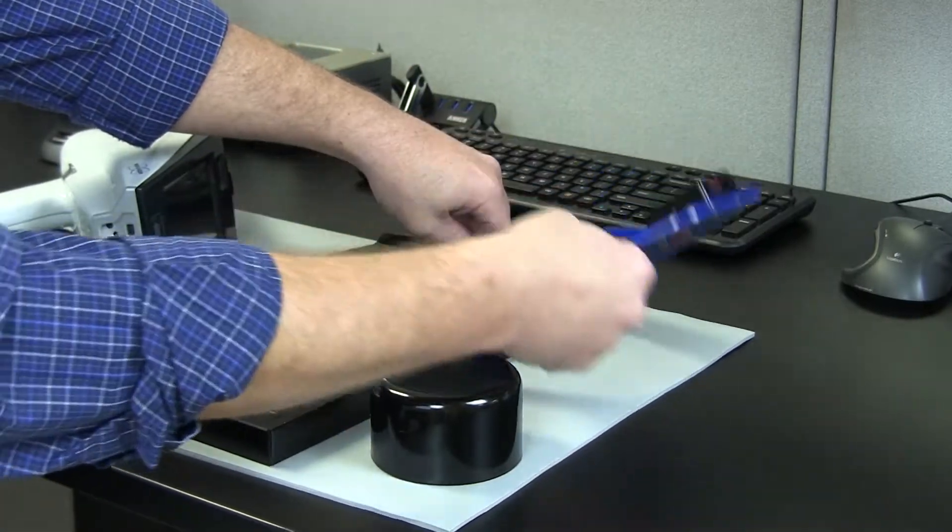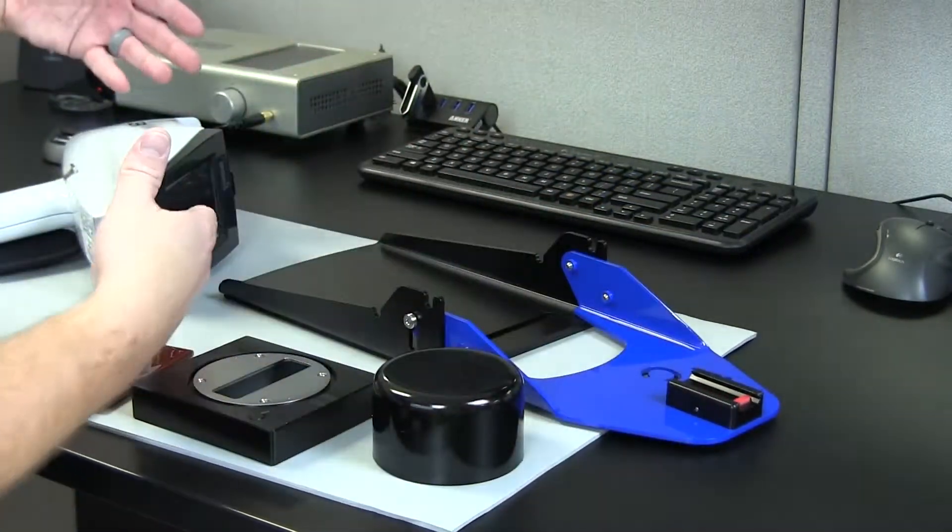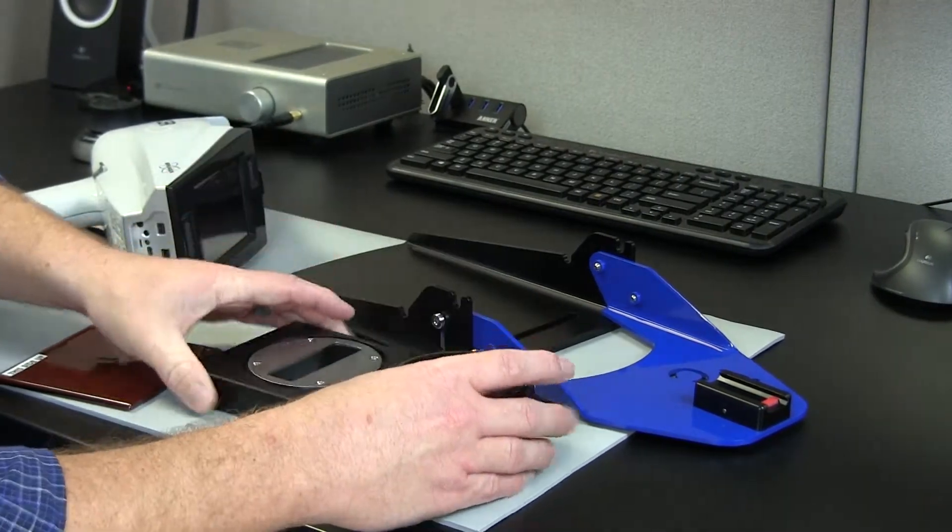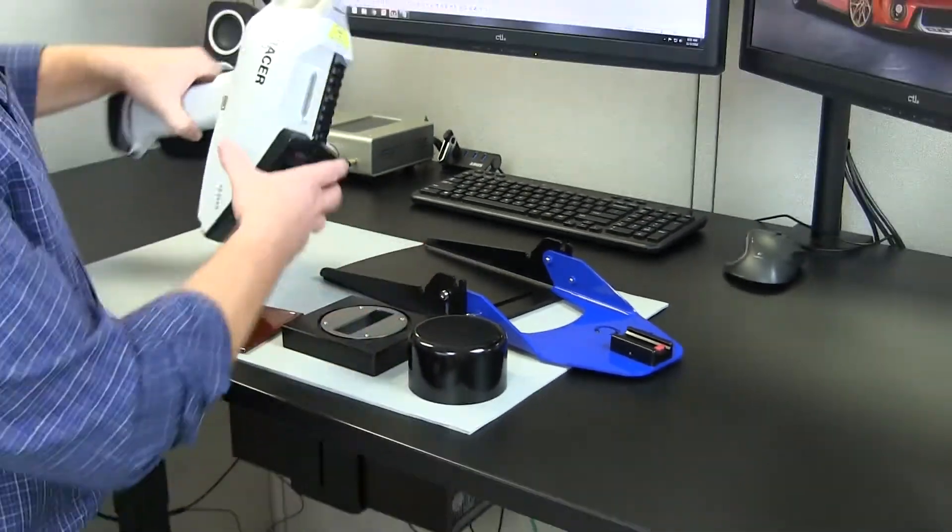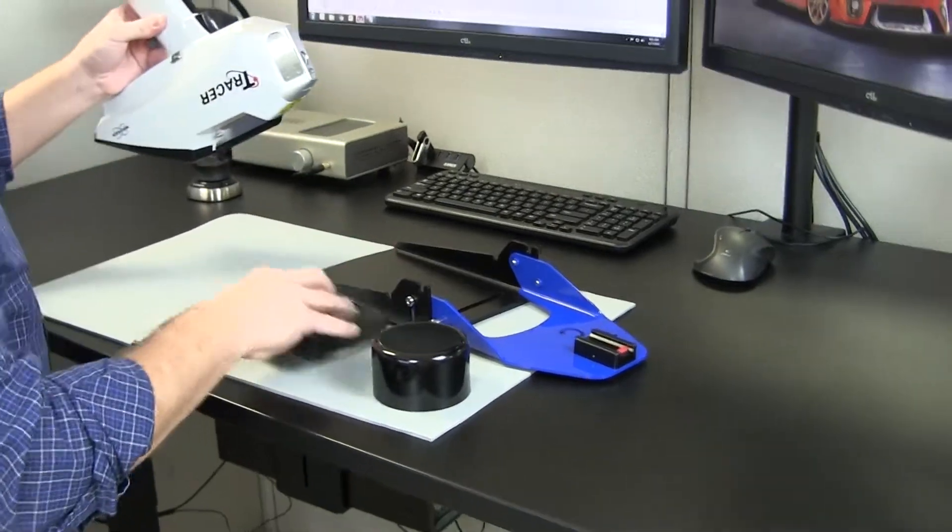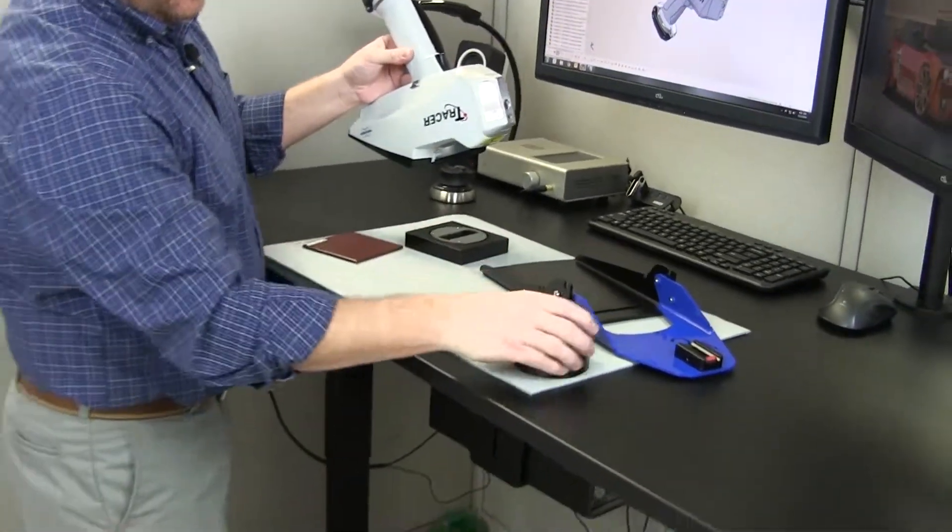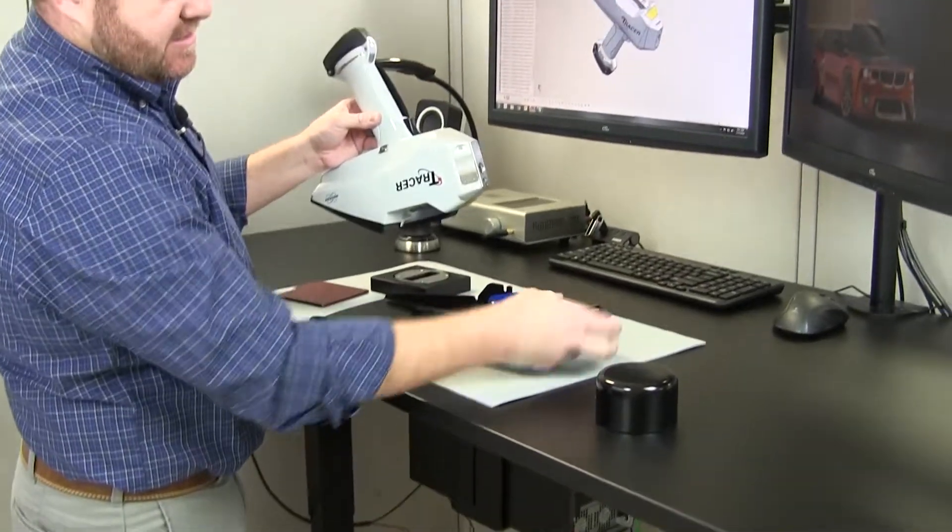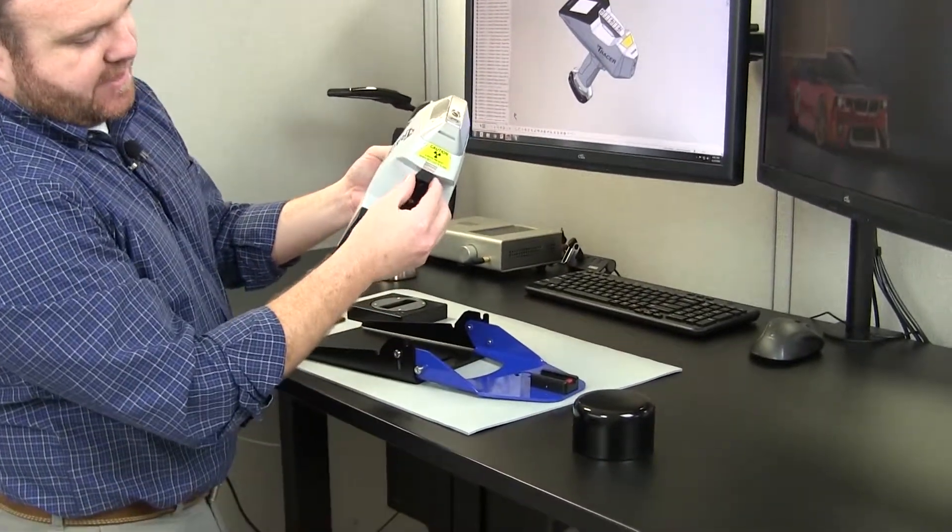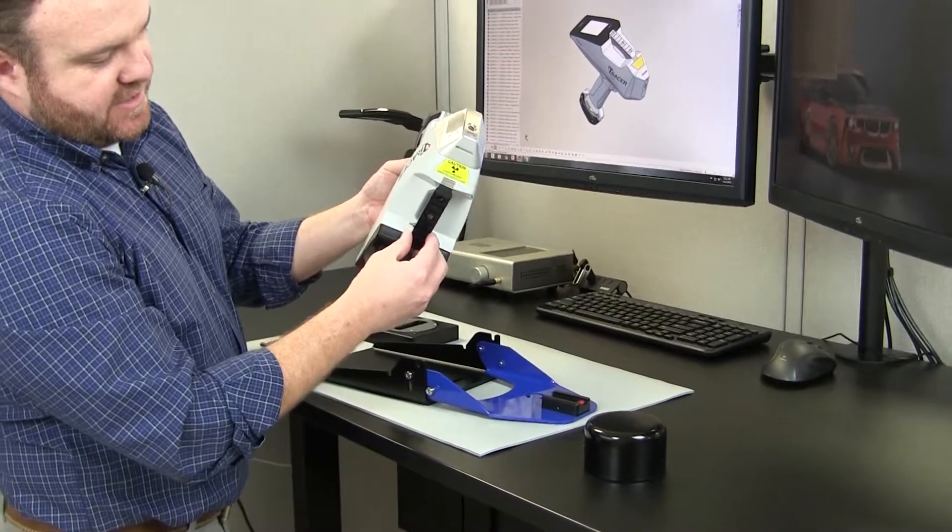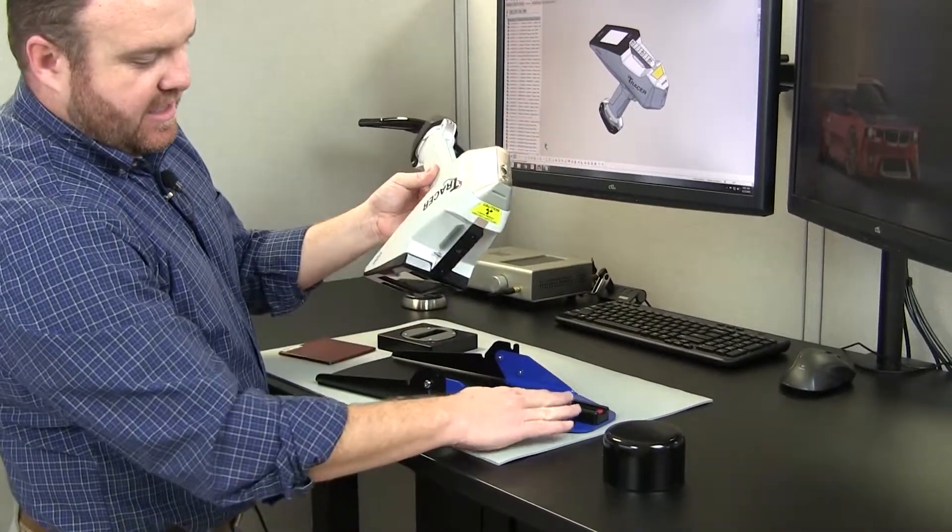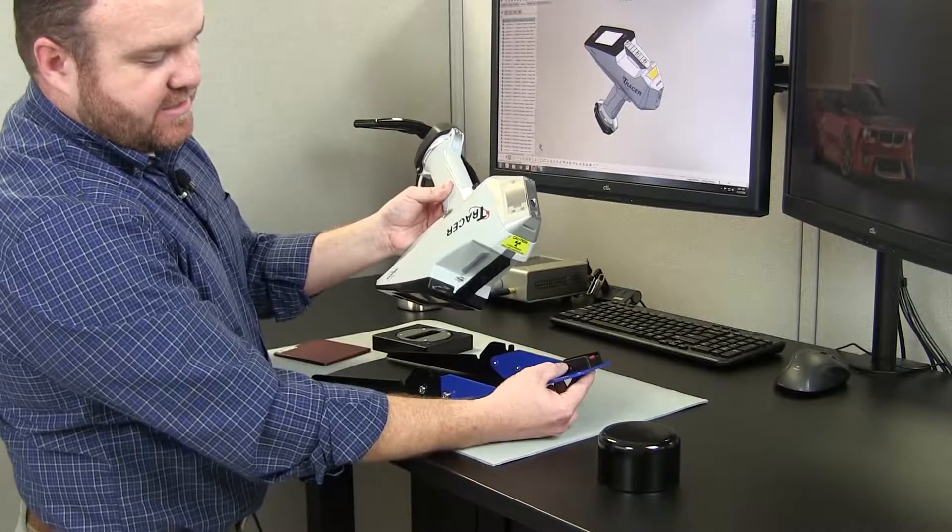It also folds all the way back so I can demonstrate how to put it in its nose up position to use the other accessories. In nose up position, the stand is laid fully open and we've designed the instrument to have this universal Picatinny rail.